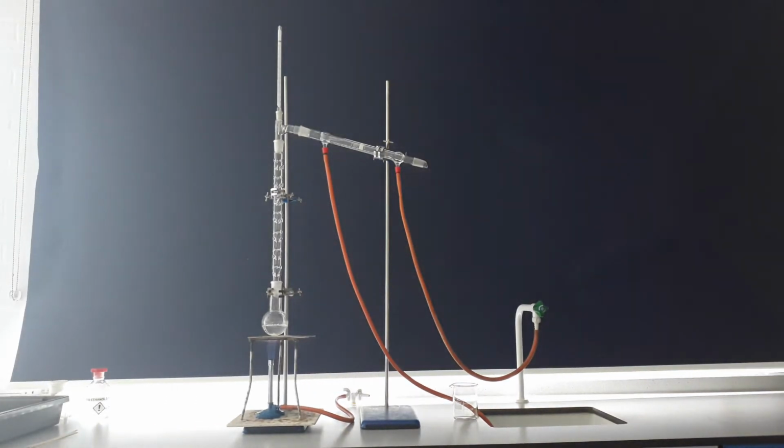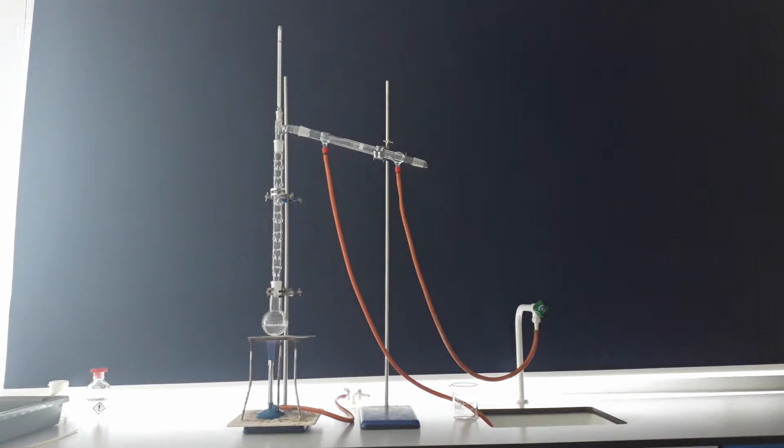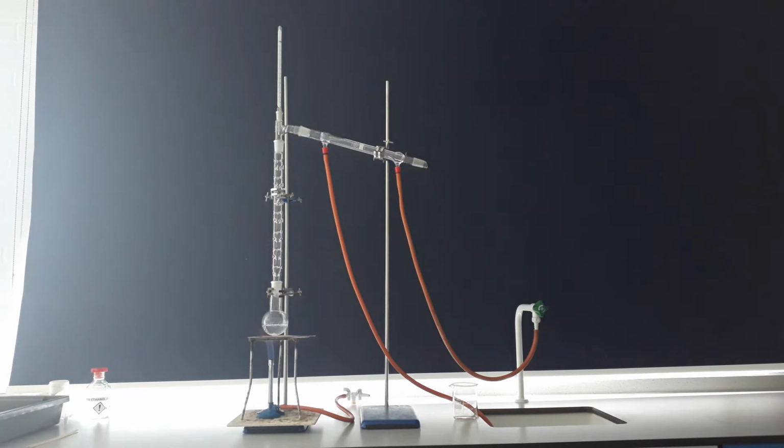This video looks at a method of separating mixtures. In this case, we are looking at the point where we are separating two substances or more, and where we would like to keep all of the substances. In the previous video, we've looked at the method of evaporation or crystallization.